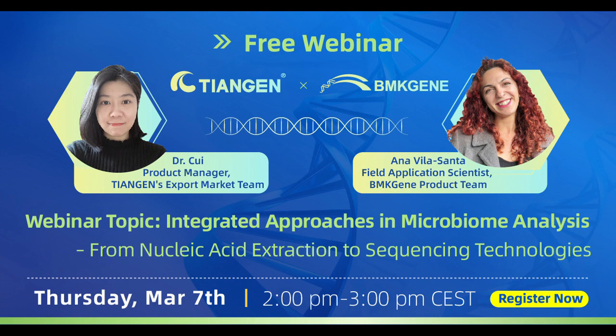Today, she will discuss two foundational sequencing methods crucial for microbiome research: amplicon sequencing and shotgun metagenomics. Anna will guide us through a comparative analysis of short-read and long-read sequencing technologies, evaluating their performance for various study objectives. Anna, the stage is yours.